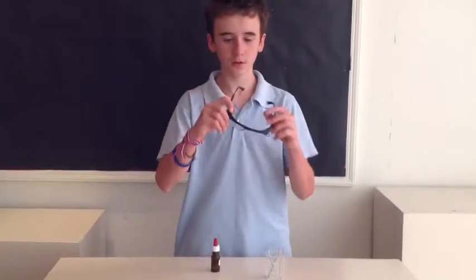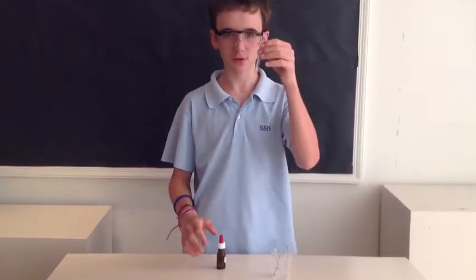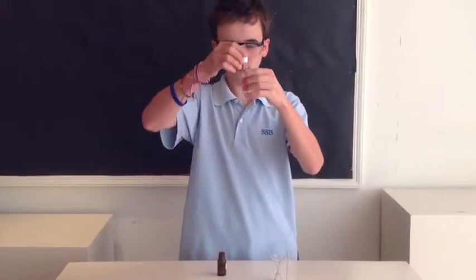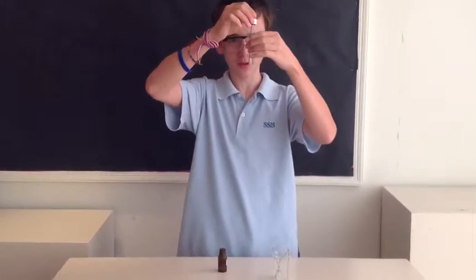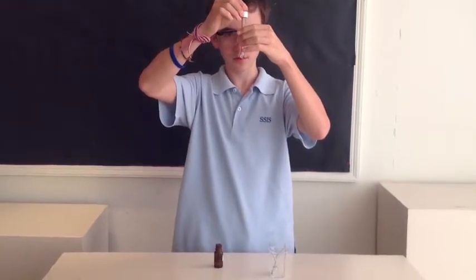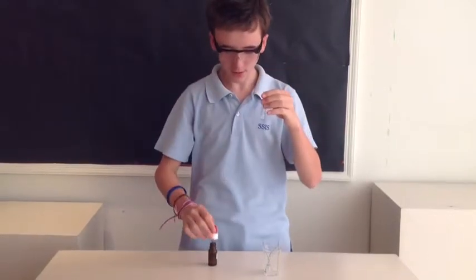First, take your safety glasses. Next, take your test tube and the silver nitrate and put about four or five drops into the test tube. Okay, like so.